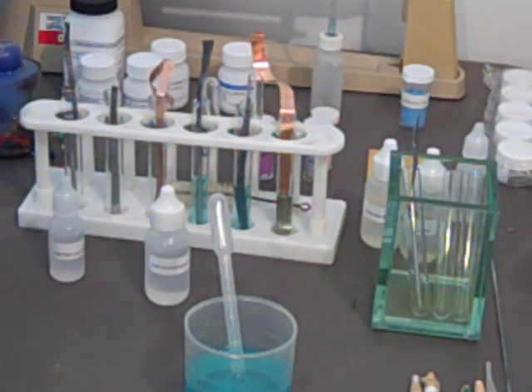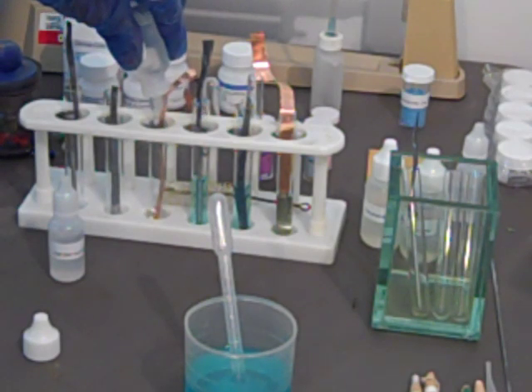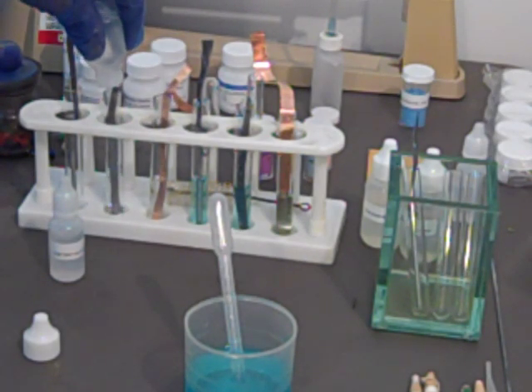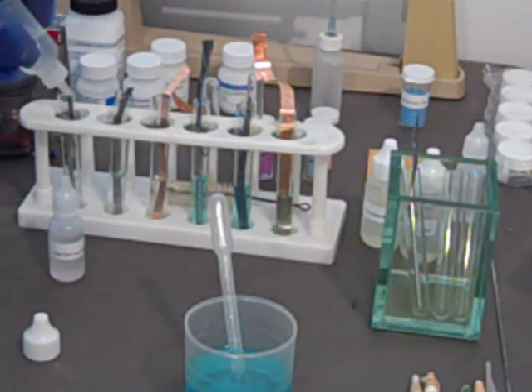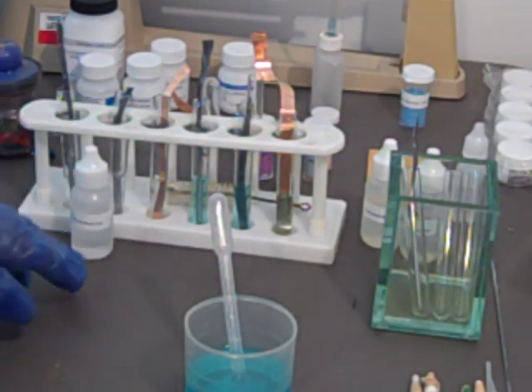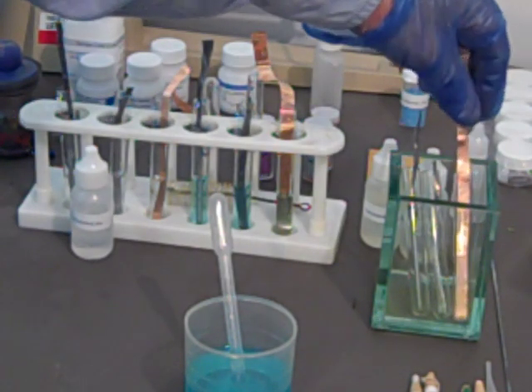This will be the lead nitrate. Lead nitrate solution should come with your kit, actually. That's what we got. We got it out of a kit. About 3 milliliters into each tube. It's hard to squeeze this. So we don't forget, we can see the copper sulfate because it's blue, but we can't see the lead nitrate. So we're going to put the lead nitrate bottle in front of the three samples. And we're going to put lead and copper strips into the other test tubes.